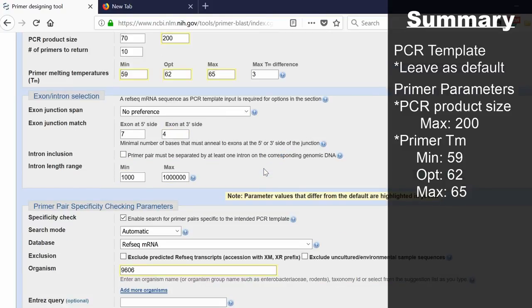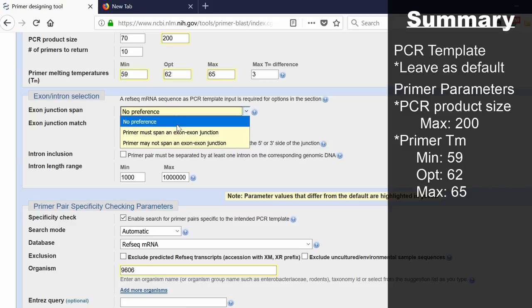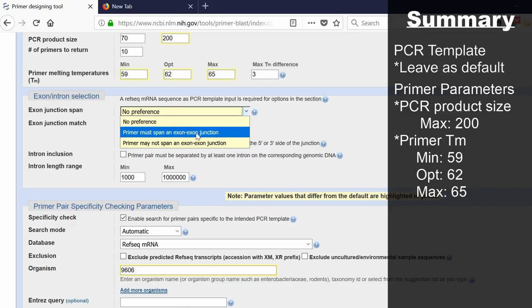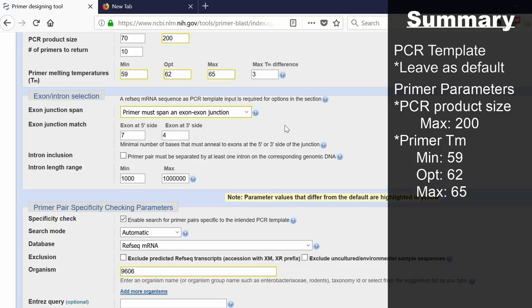The next window is titled exon intron selection. This is whether you want your primers to bind over an exon-exon junction or on two different exons that are separated by an intron. You can select to span an exon-exon junction. What this means is one of your primers will bind partly on one exon and then partly on the neighboring exon. Remember, mRNA only contains the exons, it does not contain introns.